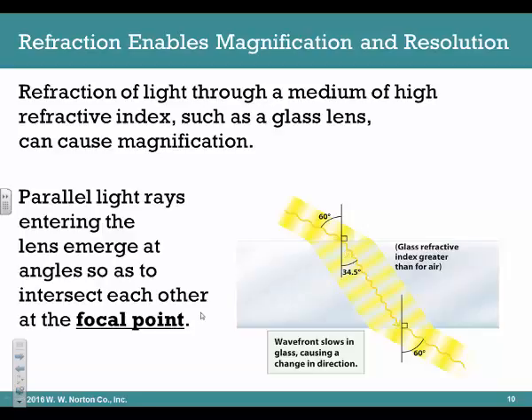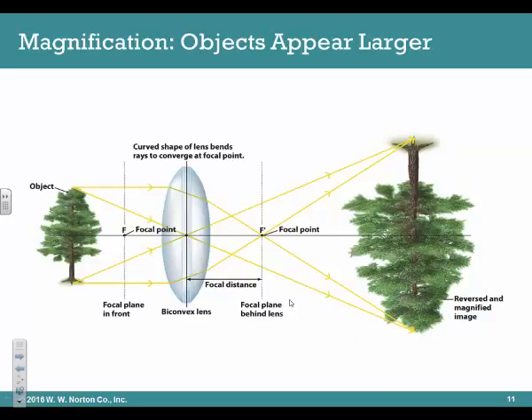And so we want to minimize the bending so that the focal point of the light continues through that objective lens so that we can see everything clearly. In order to do that, we add a material that has a very similar refractive index to glass, and that's the immersion oil that we use. Now we put a drop of that, slide the objective lens into place, and that way the image will be crisp and clear.